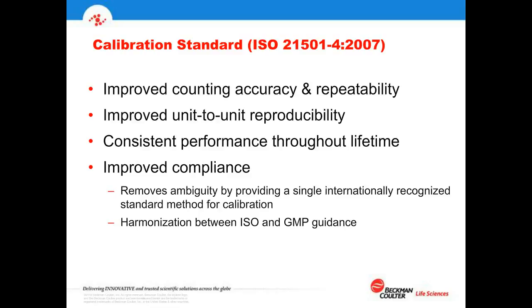So also, I can mention briefly that 14644-2, the companion document, was also revised, and it's focused on monitoring. So -1 focuses on classification, -2 focused on monitoring. I'm going to touch on that very briefly here, just because, again, it does relate to our discussion today.